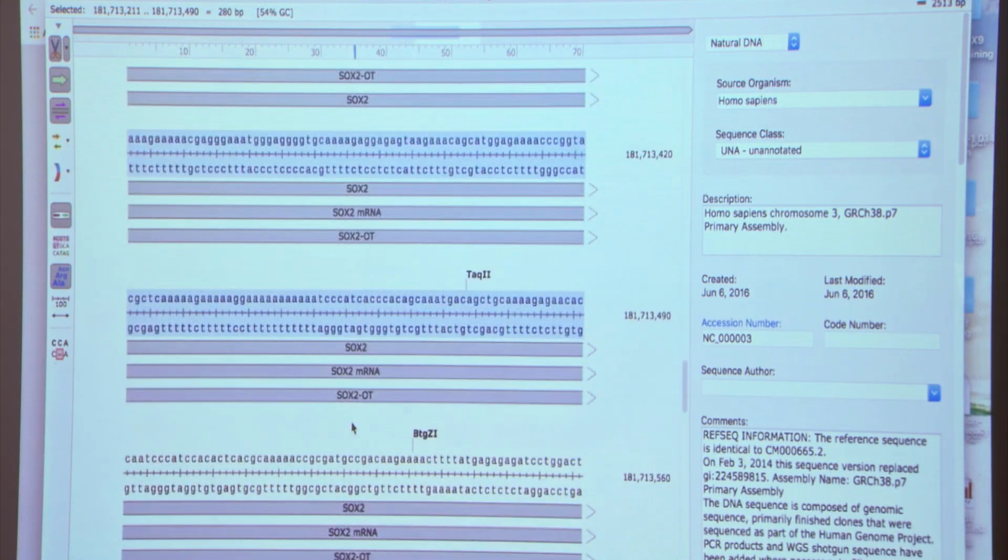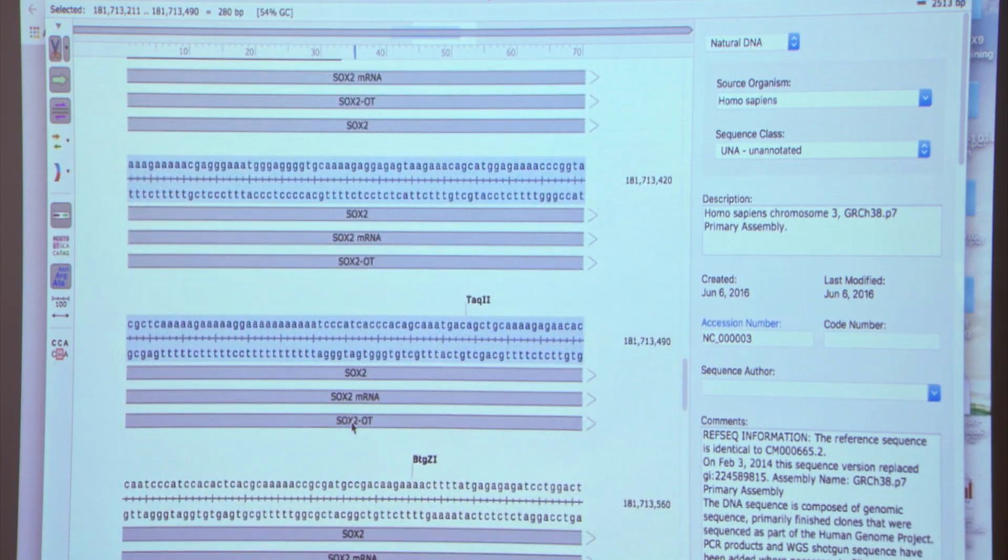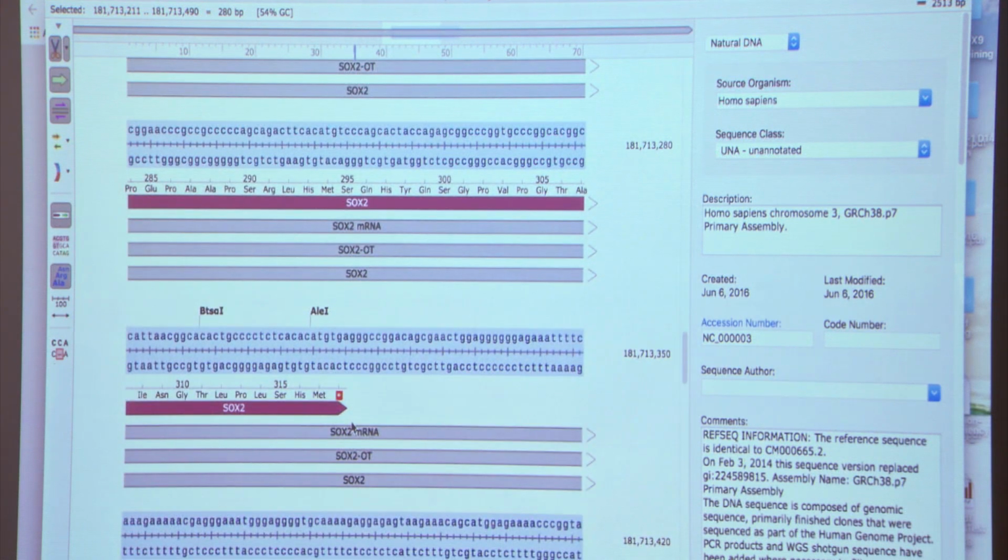So is that your sort of range for targeting? Yeah. 200, 100 in each direction? I would say 100, I would start with 100 in each direction. That's what we were originally told, as far as you want to go from the cut site that you're looking for. If you do that and there's nothing, which I've never seen, then you could start expanding. But yeah, we've always been told 100 is how far you possibly want to be.